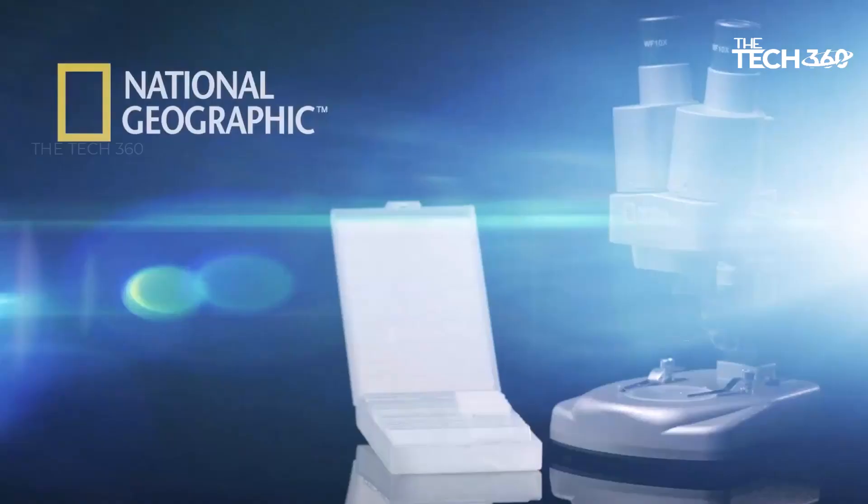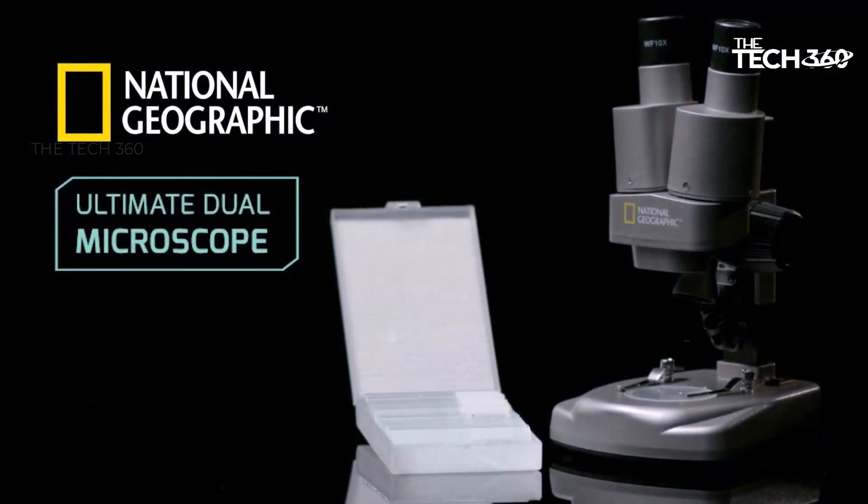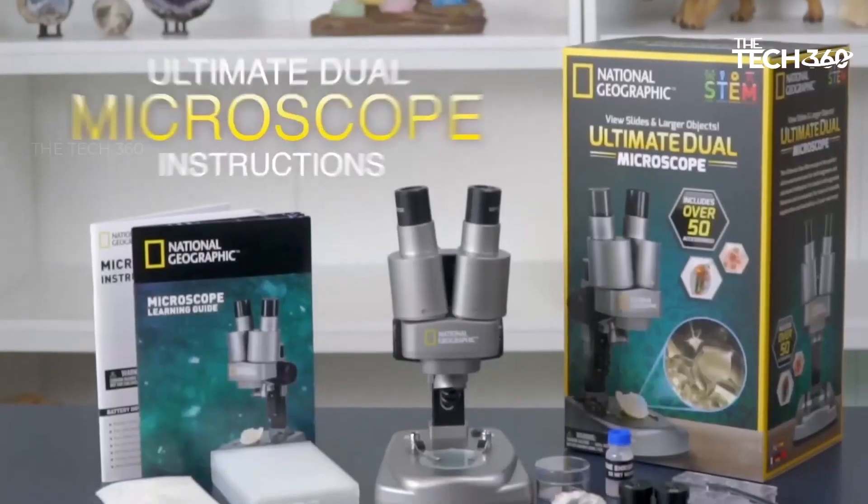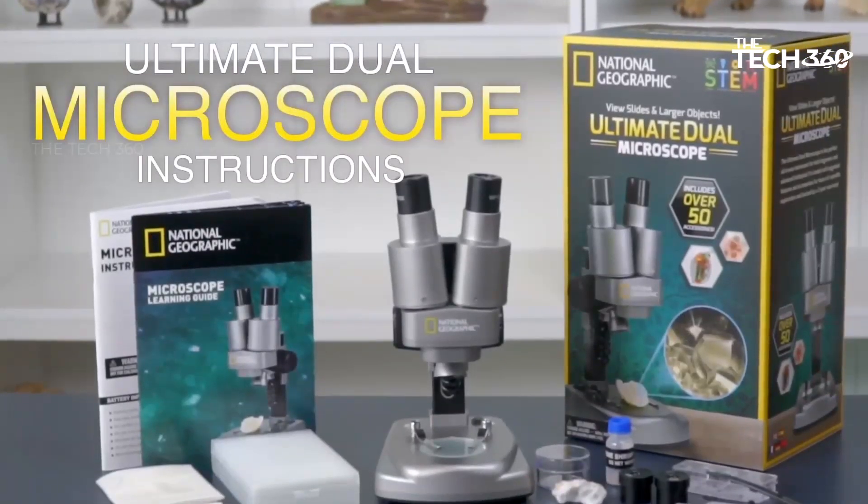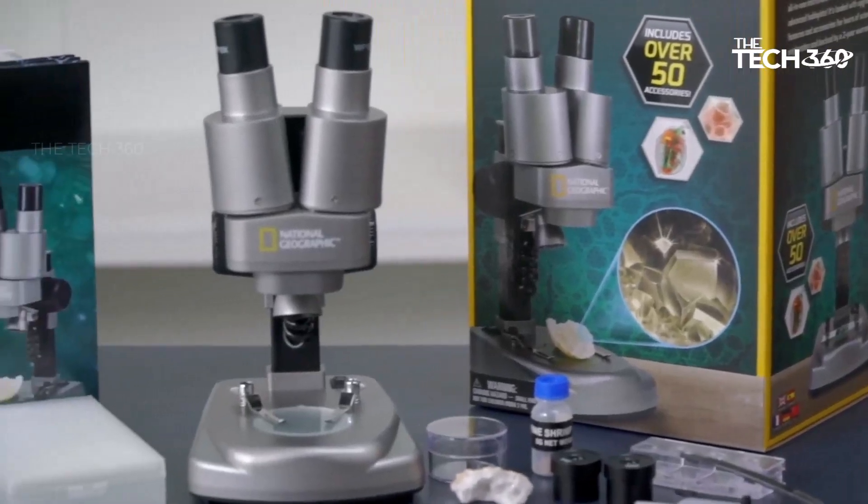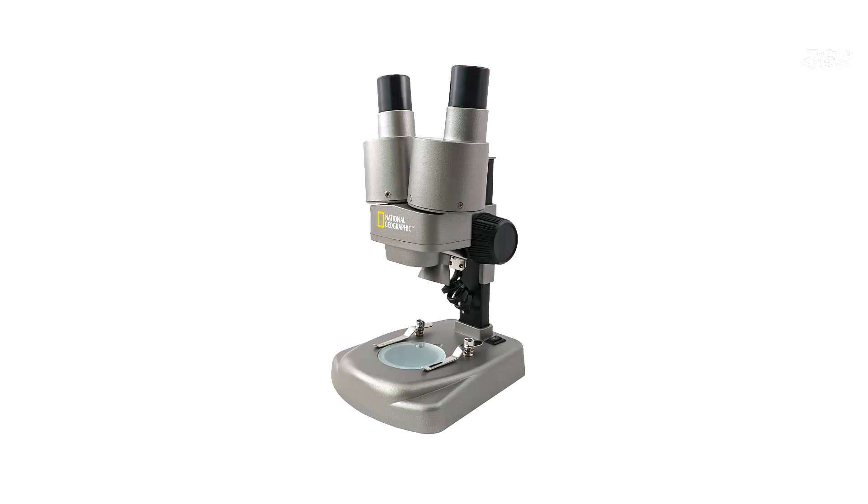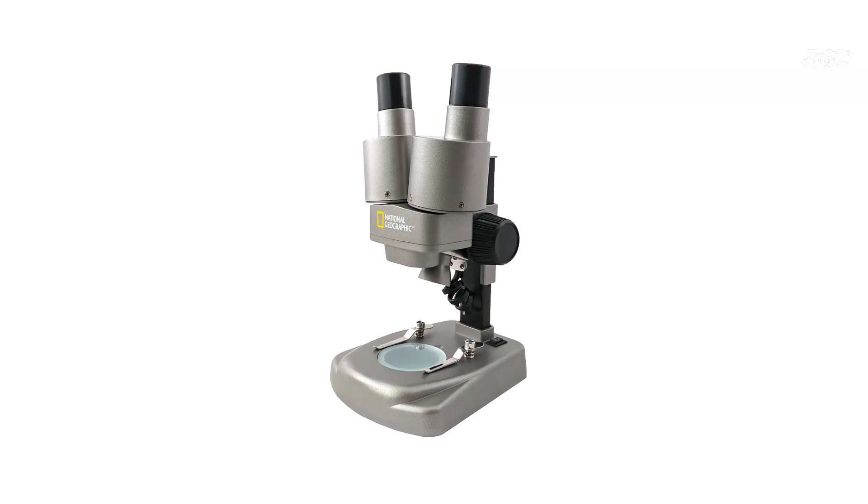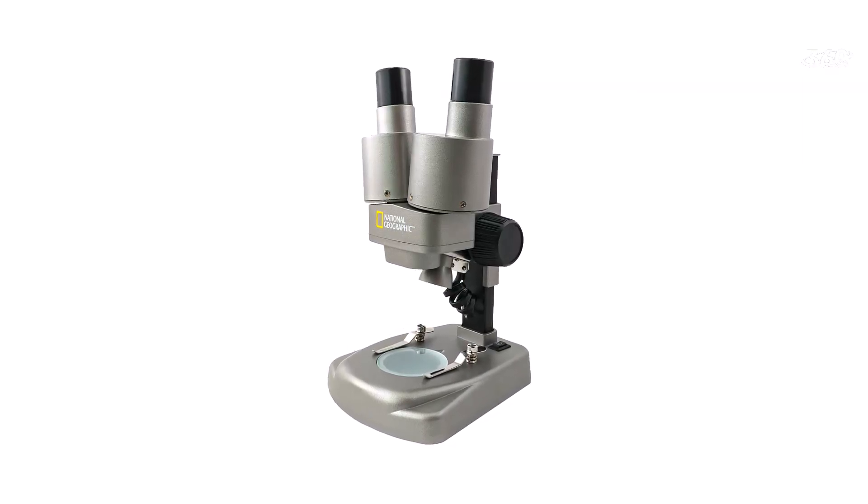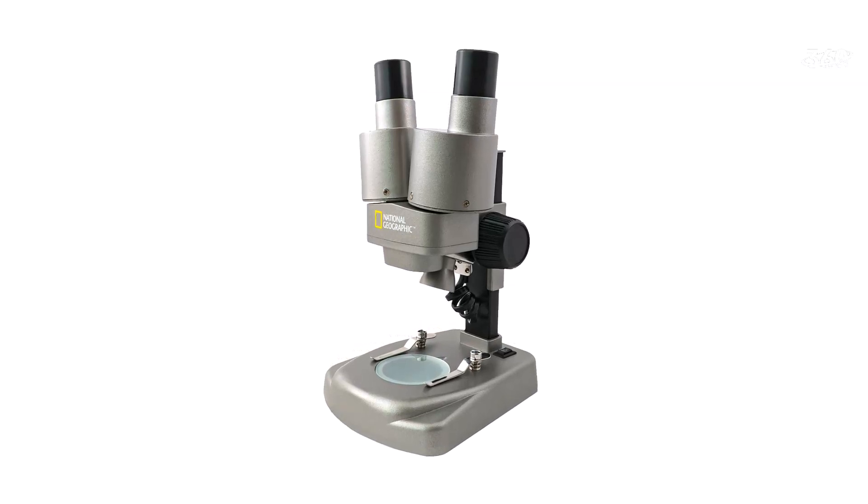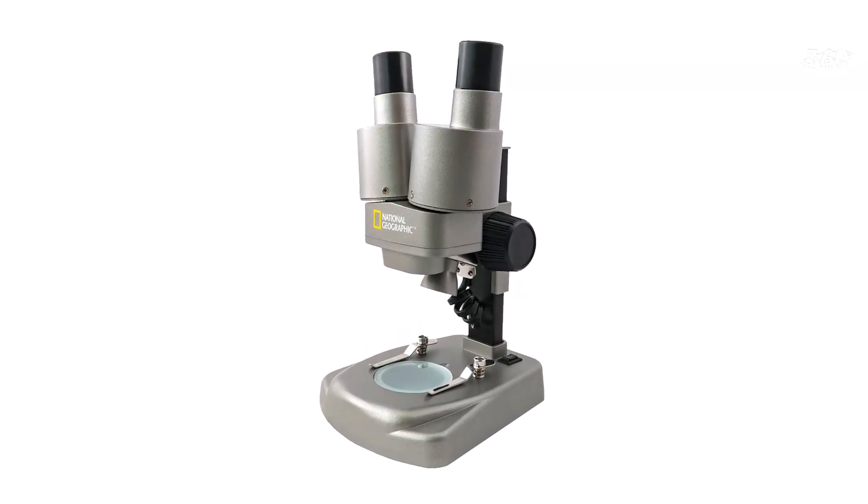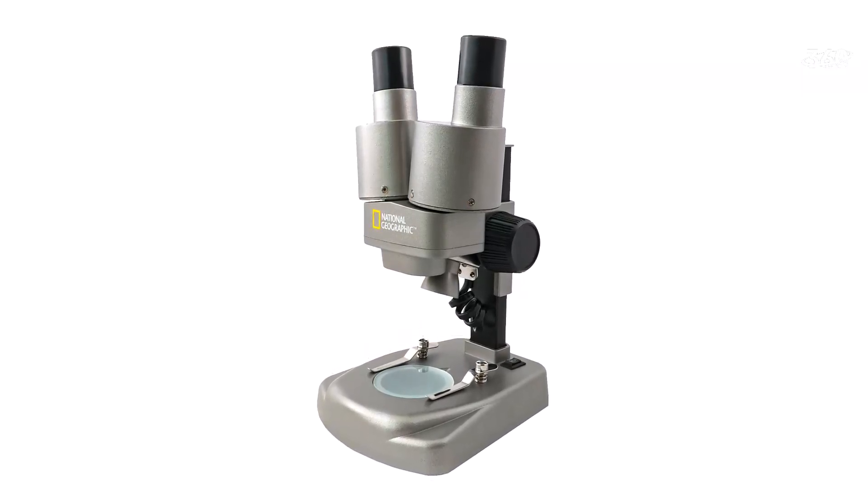The National Geographic Dual LED Microscope provides the convenience of two microscopes in a single device. Use the lower LED lights to view biological specimens on slides, and effortlessly switch over to the upper lights for examining 3D objects in intricate detail. This dual functionality adds versatility to the microscope.